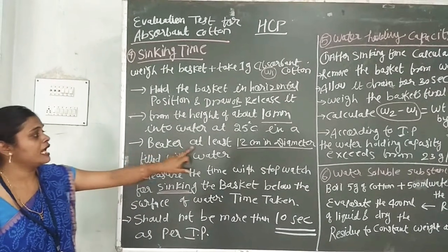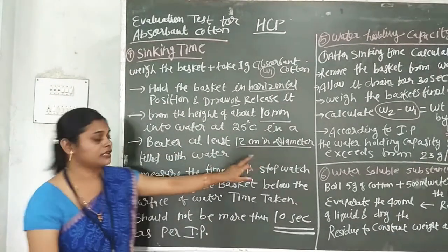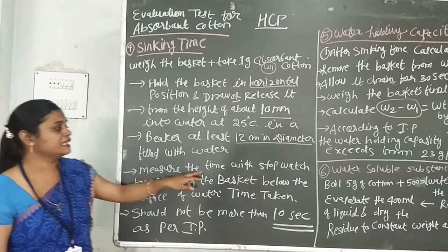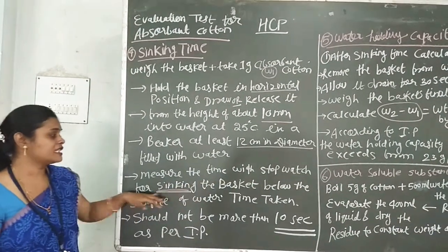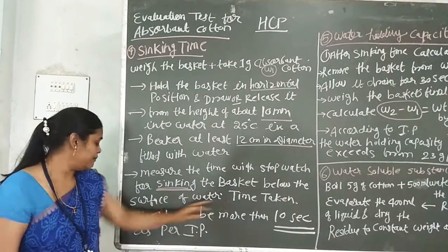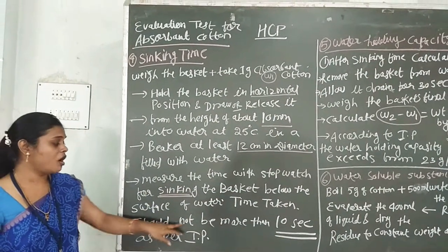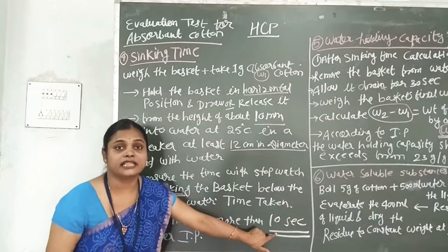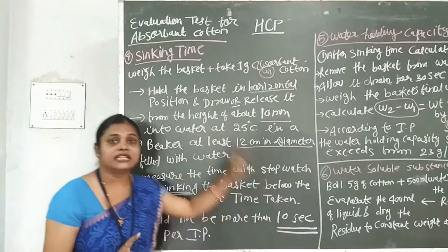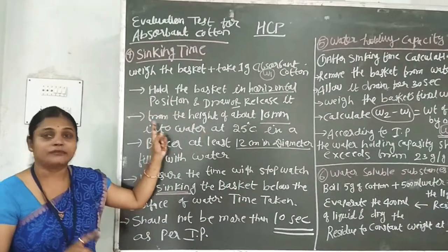The beaker should be at least 12 cm in diameter and should be filled with water. We measure the time taken for sinking the basket below the surface of the water. The sinking time should not be more than 10 seconds. This is very important. This concludes the sinking time test.